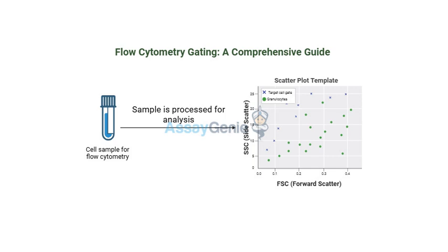Well, we've got ways to expose them. We use a combination of FSC parameters: FSC-A, FSC-H, and FSC-W. Oh, so we're looking at the cell size from different angles? Exactly. Single cells have a predictable relationship between these FSC values, but doublets, because they're two cells smooshed together, throw off those ratios. So by plotting those parameters against each other, we can spot the doublets. Ah, so we can then draw a gate to exclude those doublets, making sure we're only analyzing data from single cells.